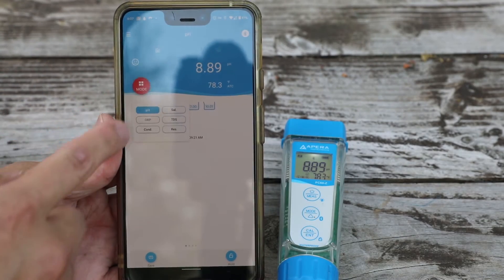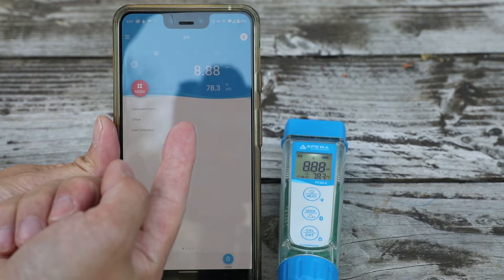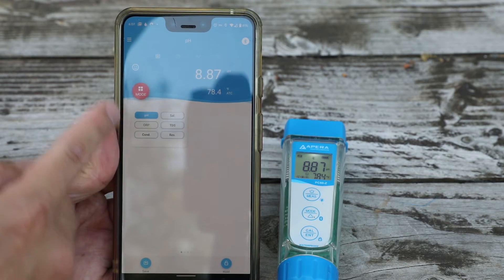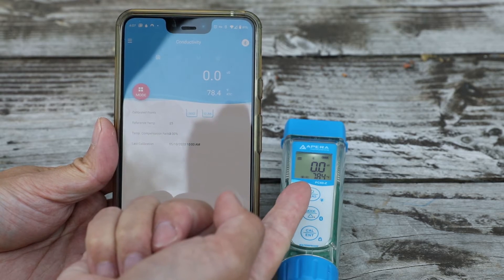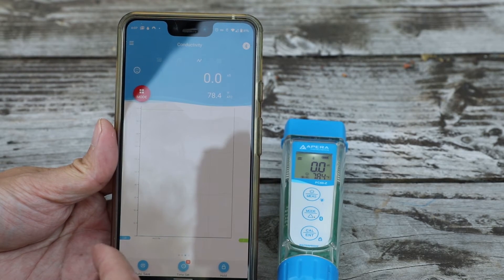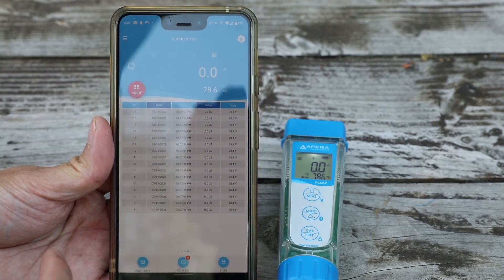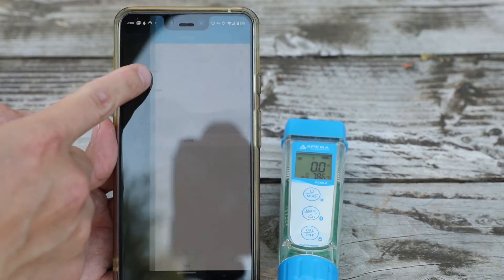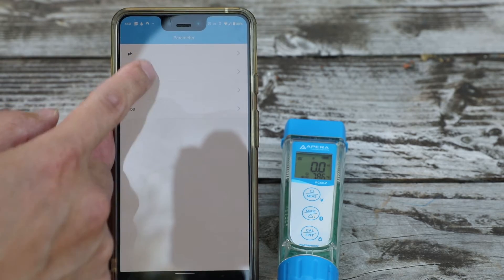The app is fairly simple and straightforward. You can control most of the measurements directly from the app. You don't need the smart app — if you don't have a smartphone you can gather most of the data directly from the instrument itself, though it's nice to have. The app displays information in various formats. On the menu it has different options for measurements, calibration, data, and settings, and the settings section has a lot of full features worth exploring.